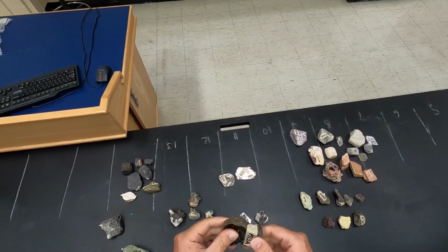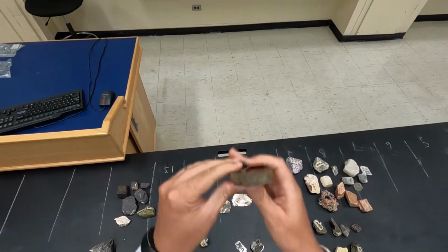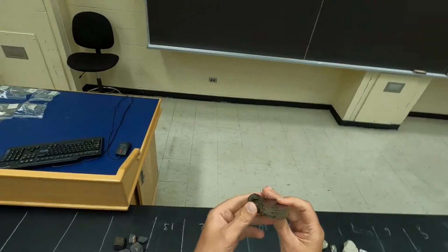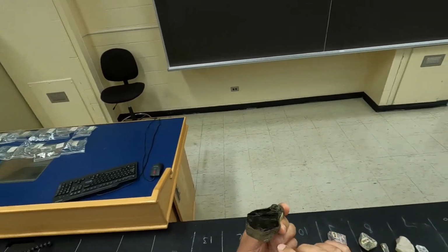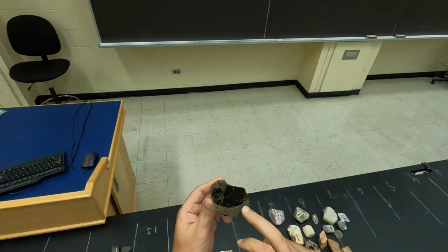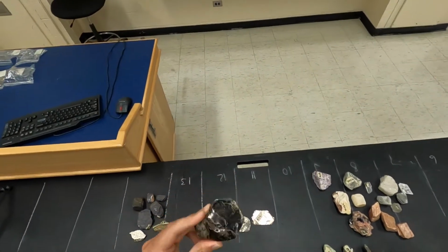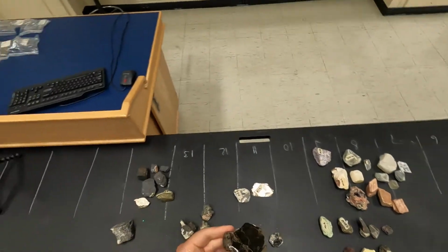You can recognize a structure that is formed by a series of planes, and I can definitely see several lines in here which are evident in all faces, which suggests that you have multiple layers, and this should tell you based on the lecture straight away that this is one of those phyllosilicates that we mentioned.